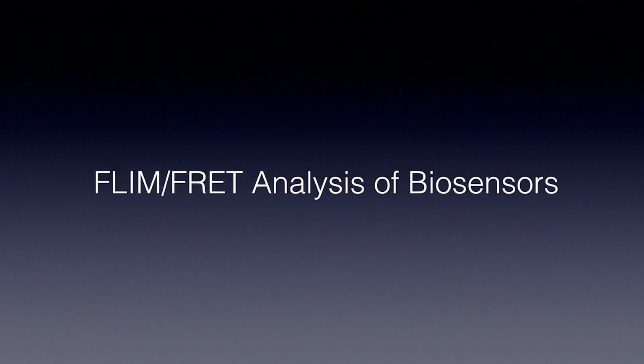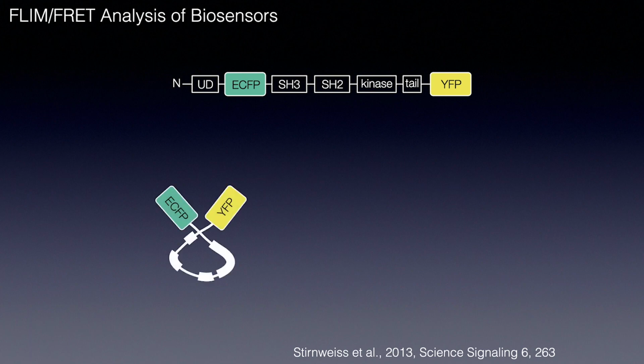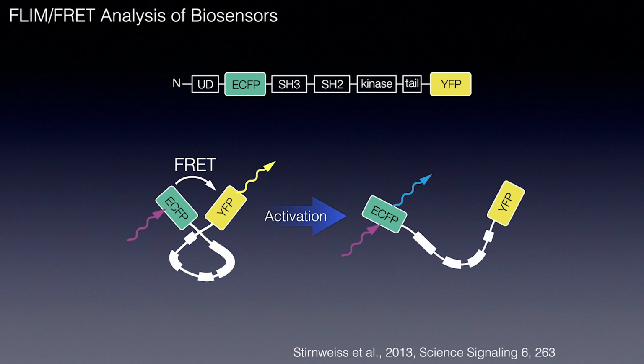One of the most exciting applications is the use of FLIM to measure fluorescence resonance energy transfer, or FRET. This allows us to measure intramolecular distances with angstrom accuracy using simple light microscopy. Here you can see an LCK molecule marked with two fluorescent proteins, CFP acting as a donor and YFP acting as an acceptor. In a non-stimulated state, the molecule is folded. We excite the ECFP chromophore, and this will very likely result in a FRET reaction, and we can see the light from YFP. Upon the activation, the molecule changes its conformation, and thus the FRET signal vanishes.